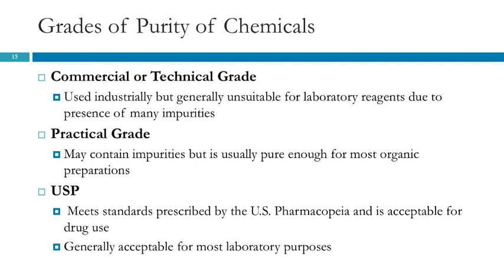So what's called commercial or technical grade is commonly used in industry, but generally would not be suitable for use in a chemistry lab because there are many impurities. It's good enough for the purpose that industry uses it for, but not good enough for the chemistry lab. The practical grade contains impurities, but usually it's good enough for organic preparations, but not analytical preparations.